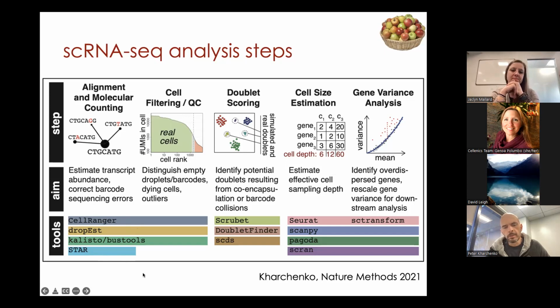There are other tools as well, open source ones that have been developed. They all make some assumptions, and they all have some approximations and tricks for, let's say, accounting for sequencing errors in the barcodes. So here's a quick illustration of one method for accounting for sequencing errors, which is to do a little clustering, if you're, let's say, counting unique molecular identifiers for a given gene.